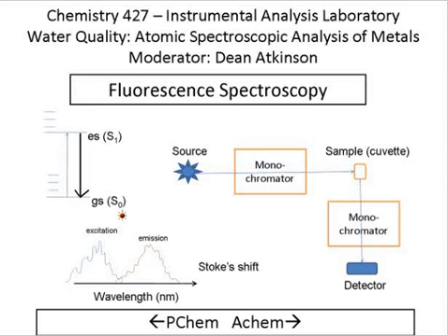But from the analytical perspective, this is both a good and a bad experiment. The reason that it's both good and bad has to do with this cartoon over on the right-hand side, the analytical chemist's version. So imagine that we took a source and we shone it on the sample, which is contained in the cuvette here.